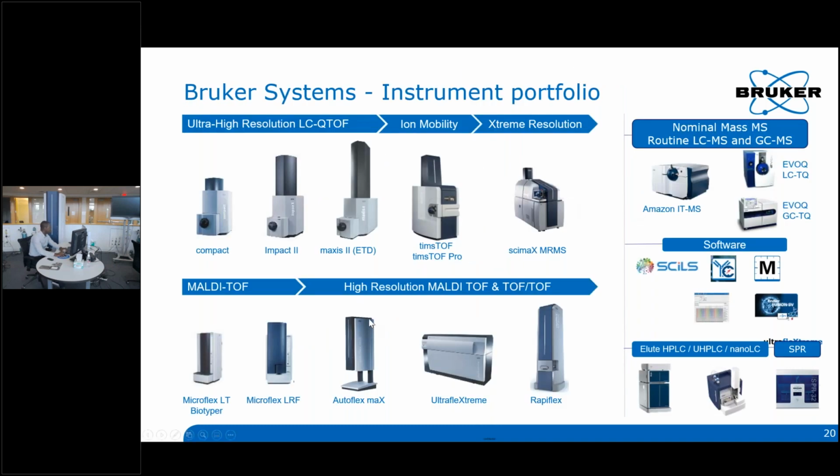Also, not to forget that although we looked at MALDI today, we have a large portfolio of other instruments as well, from high resolution LC QTOFs to ion mobility instruments, and also routine LCMS and GCMS instruments that you have available from Bruker, all supported with industry standard software and other add-ons that you can get from Bruker.